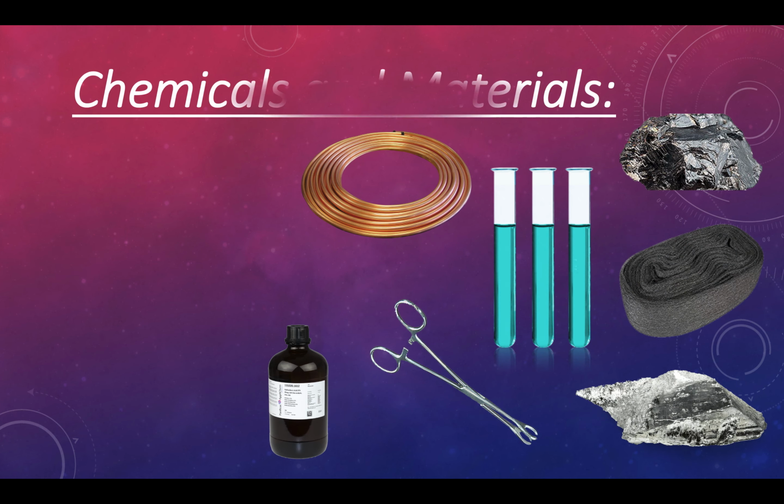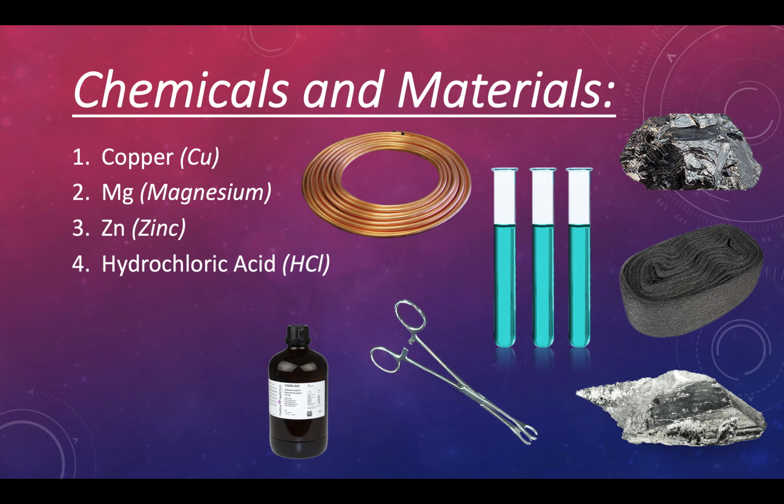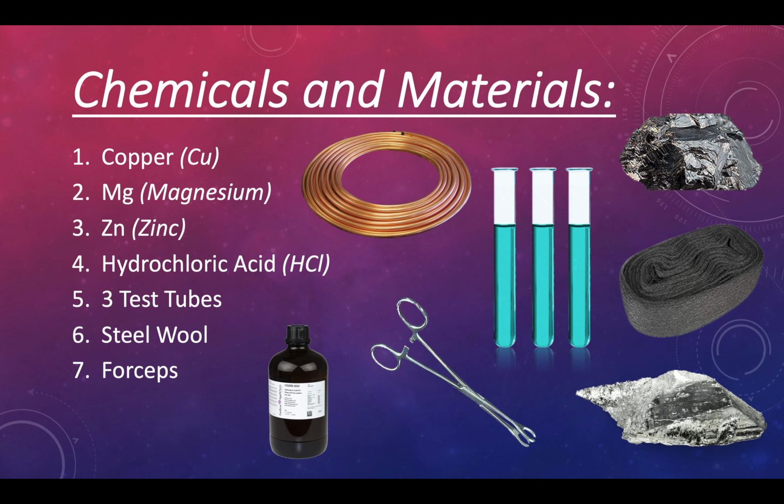Now moving on to the chemicals and materials that we'll be using today, we have our copper, we have magnesium, zinc, hydrochloric acid, 3 test tubes, steel wool, and forceps.